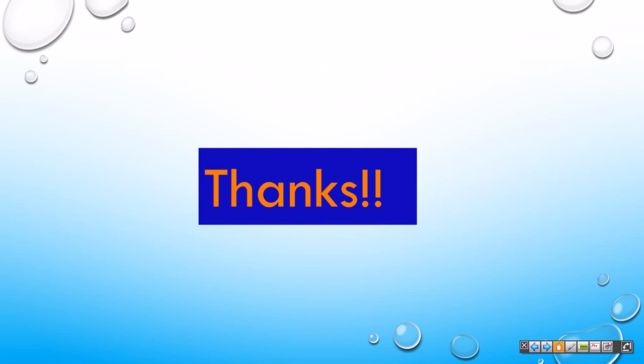And it does this very fast, 200 to 500 drops per second, from any well to any well. So what would take you manually, or using another liquid handler, seconds or minutes to set up a plate, is really fast.